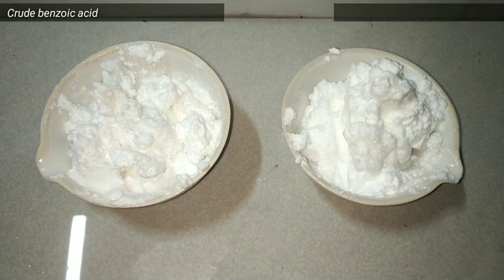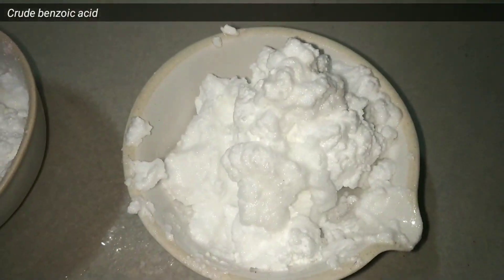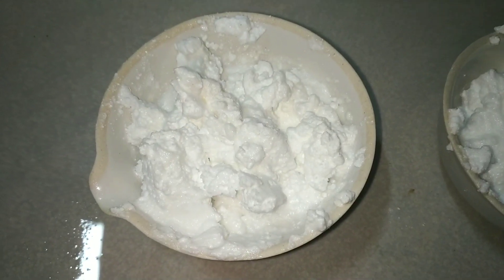Finally, this is the crude precipitate of benzoic acid that I collected. Now we need to purify it.